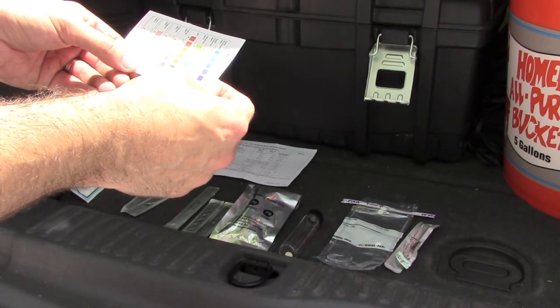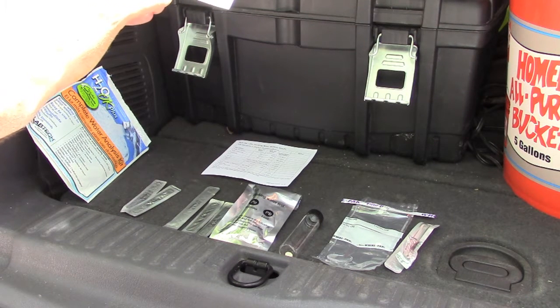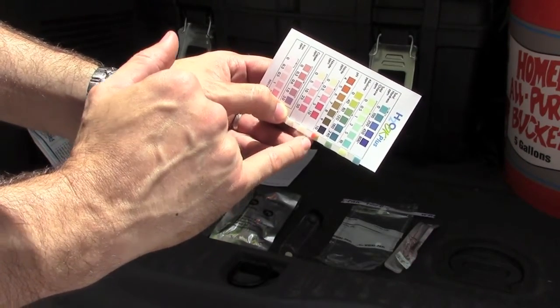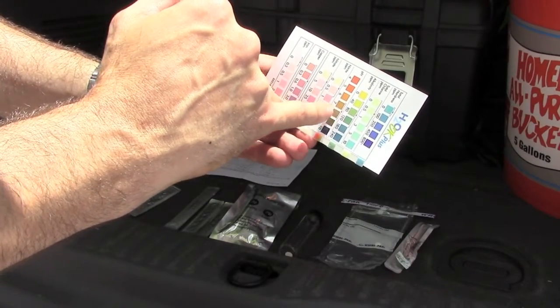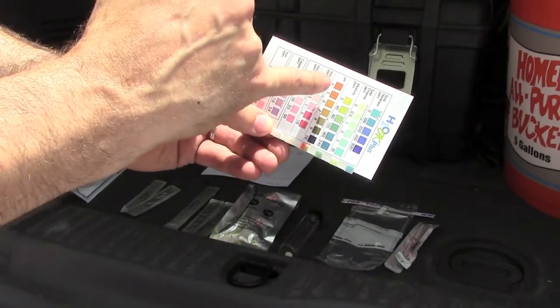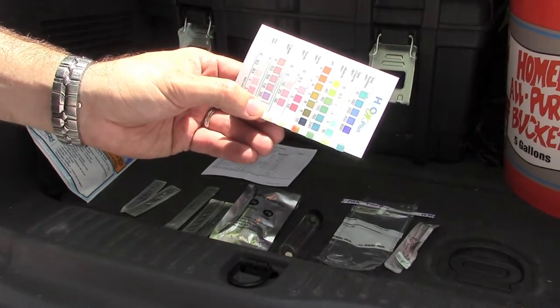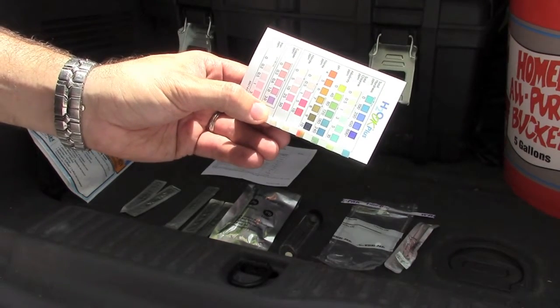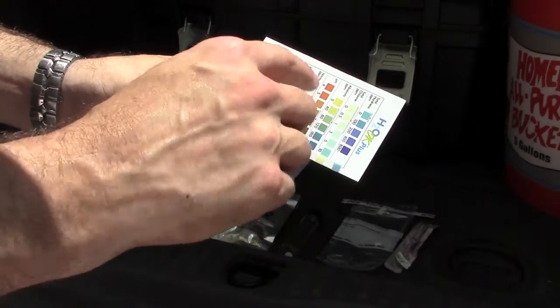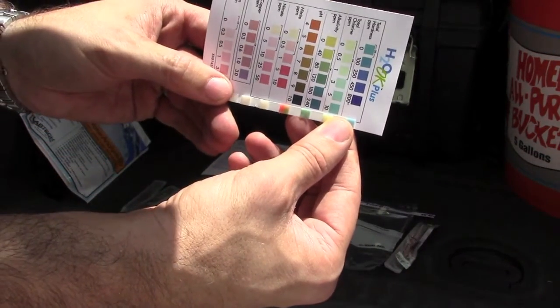Alkalinity is about 120 parts per million — I'd like to understand that more and will read up on it later. The pH is turning red fast, showing two different colors — one green, one red. The green falls in the 8 range, which says okay for pH. Nitrates and nitrites are both at zero, which is fantastic. We have a cow pasture behind us with no heavy farming, and our well is at 200 feet.